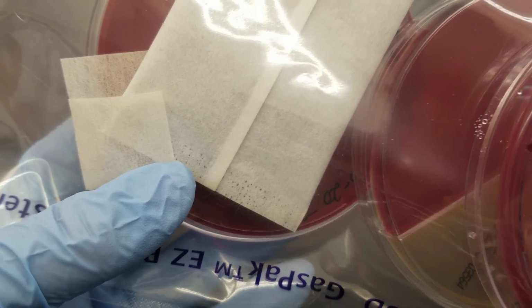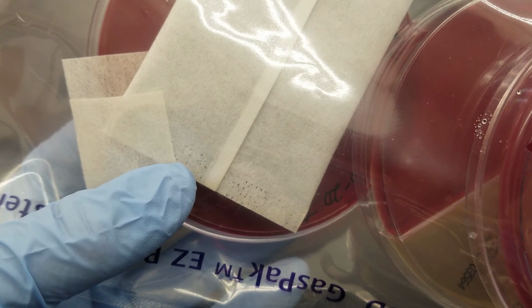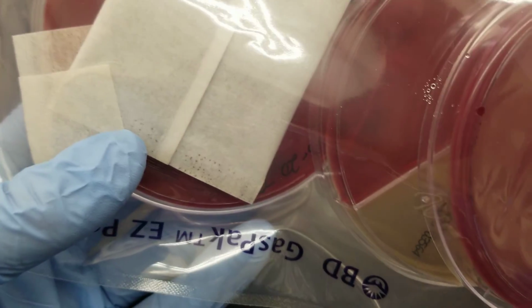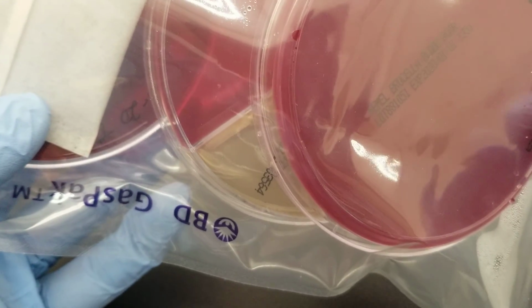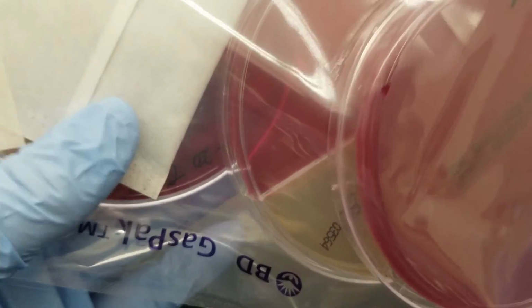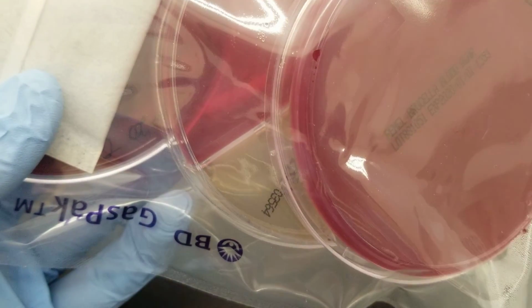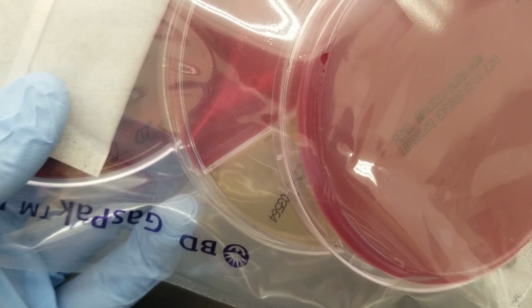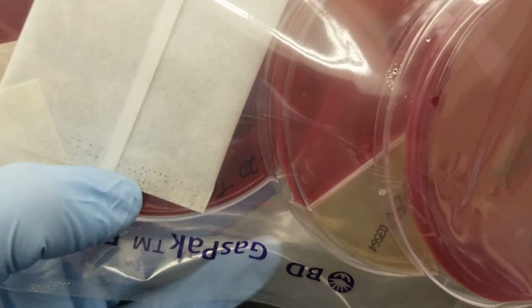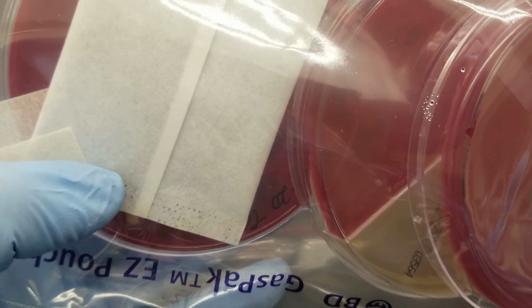However, if you have a specimen that ended up growing a facultative anaerobe or an organism that had swarming, you would want to end up going to the PEA. Oh, sorry, this is the Brucella blood agar. You would end up going to the PEA if you notice lots of swarming on the Brucella blood agar plate, which could indicate Proteus or Clostridium species. That way the PEA plate is going to make sure that they don't grow and swarm the obligate anaerobe out.